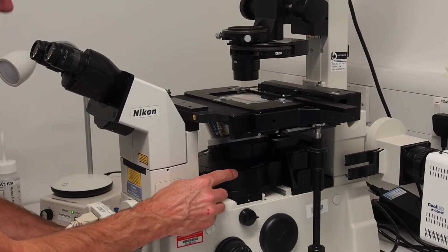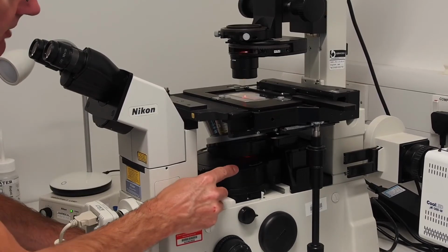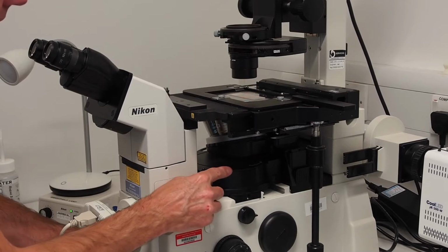Once you have finished looking at your sample, you can turn off the fluorescence either at the handset or using the manual shutter handle on the microscope body.